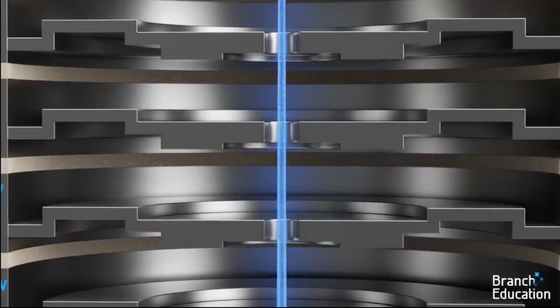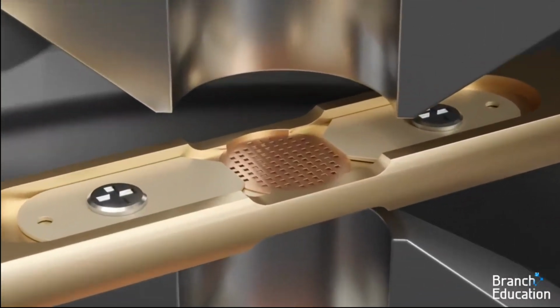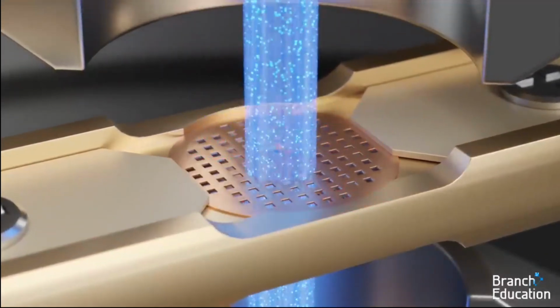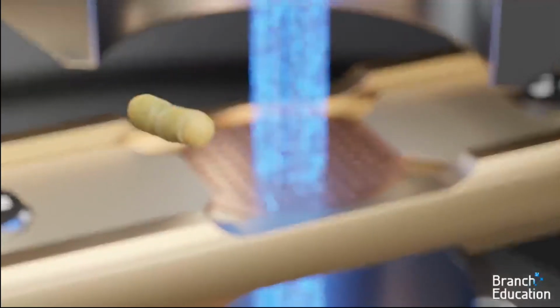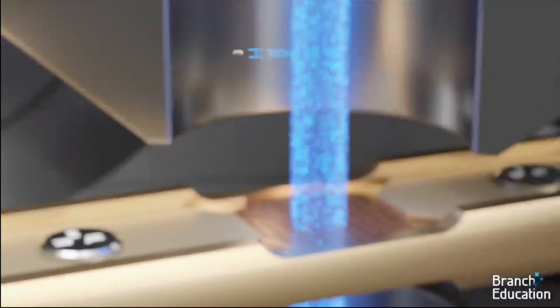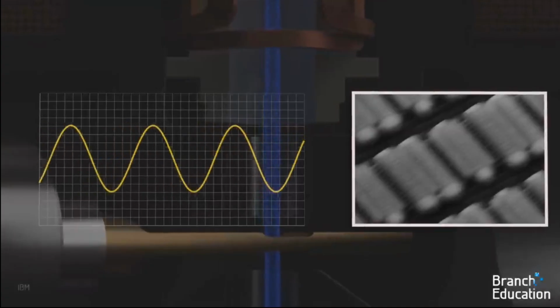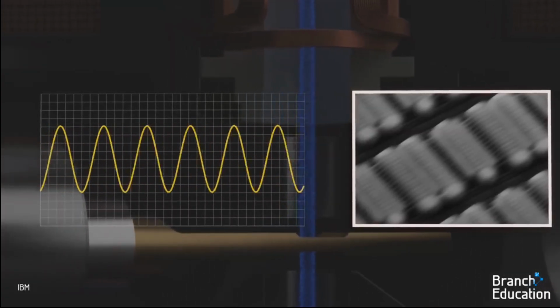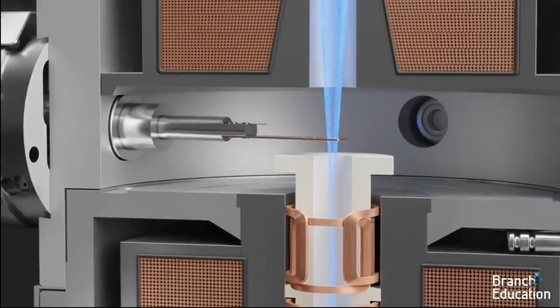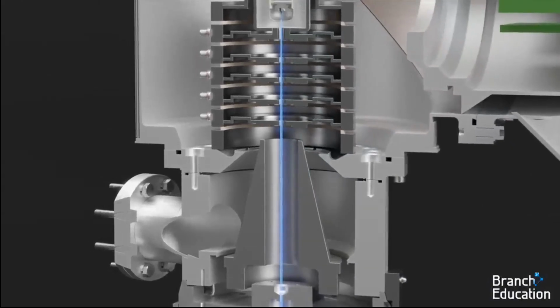There are two key reasons for the incredible speed of the electron. First is so they can travel through the specimen, whether it be a transistor, protein, or a crystal lattice, or something else that has been sliced to typically only 100 nanometers in thickness. And second, as mentioned earlier, electrons exhibit wave-like properties, and the faster they are, the shorter the wavelength and the higher the resolution achievable.